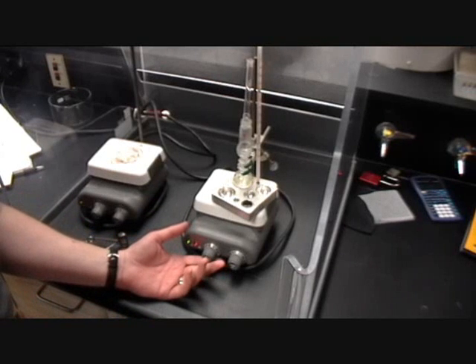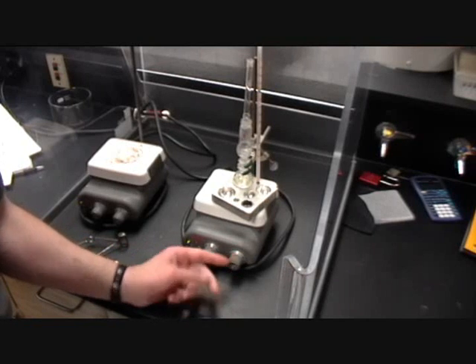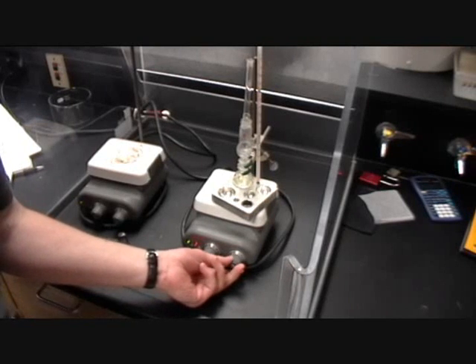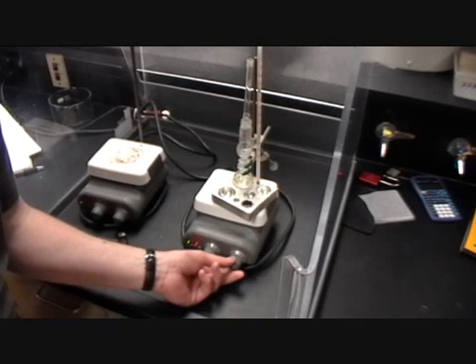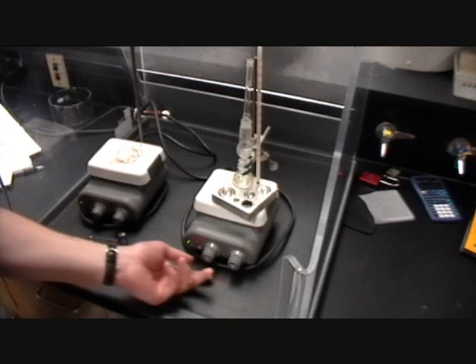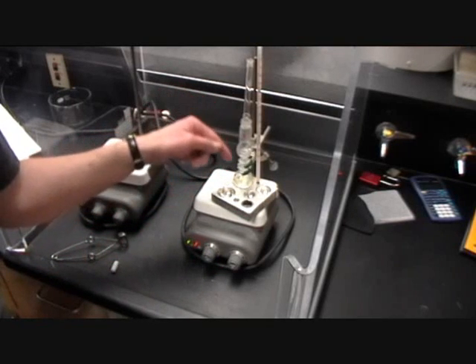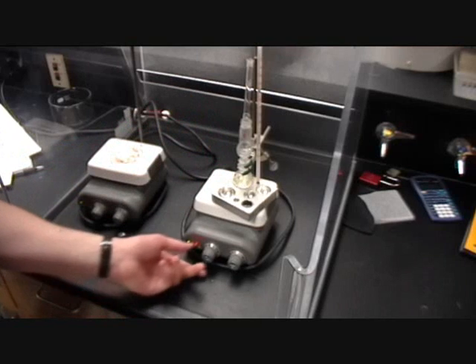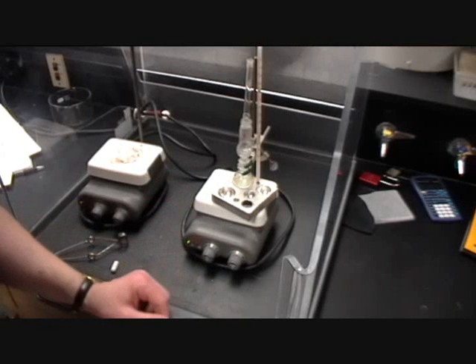Your hot plate has two main dials. There is a dial for heat which controls the amount of heat to apply. For most things, start out at maybe four or five and then adjust accordingly depending on how much hotter or cooler the sample needs to be. We also have a stirrer dial — you can place a magnetic flea inside your solution and turn on the stirrer to maybe five, six, or seven to stir the solution and evenly distribute the heat being applied.